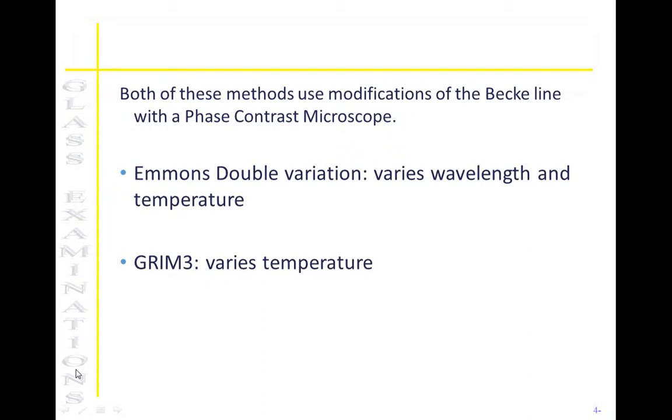We discussed very briefly in the microscope lecture about a phase contrast microscope. This microscope has two different components that are placed into that optical light path of the microscope, which help create greater contrast for viewing samples.